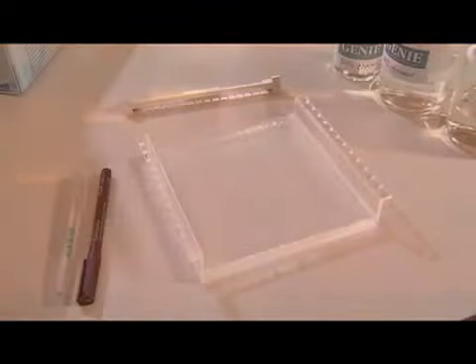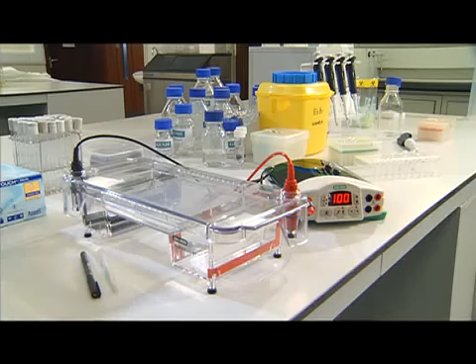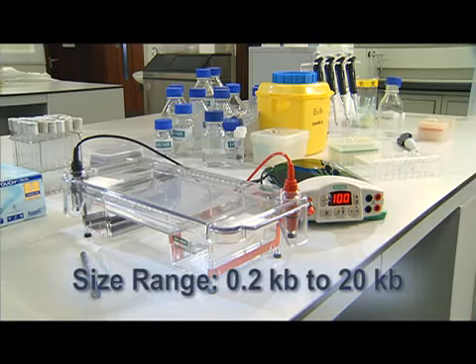Agarose gels are used in molecular biology for the separation and purification of nucleic acid fragments. A dye is added so that the fragments can be visualized under ultraviolet light. The samples are loaded into the wells of the gel and separated by size using an electric current. The size range of fragments that can be separated using agarose is between about 0.2 kilobases and 20 kilobases.